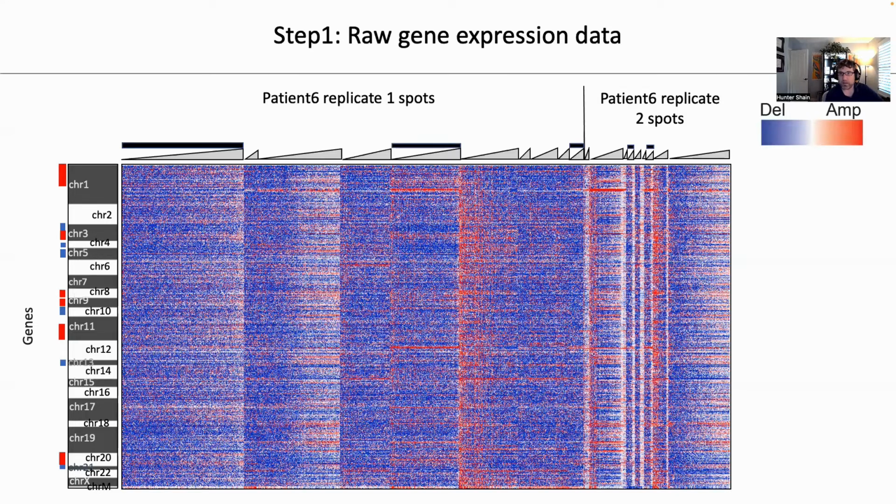Now, we did one thing before creating this matrix, and that is we grouped some spots. When you look at spatial transcriptomics data, it is not uncommon for there to be wide ranges in the number of UMIs or reads per spot. And this is, for instance, in skin, typically associated with cellularity. So you might have tumor cells which have a large number of sequencing reads from the spot overlying them, whereas the stroma, mostly composed of fibroblasts, more paucicellular, might have tenfold less reads.